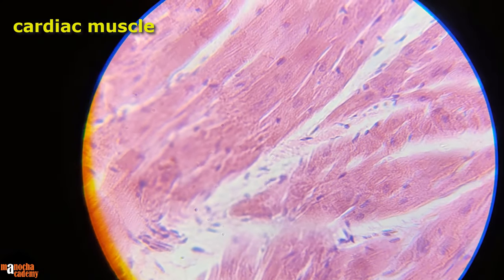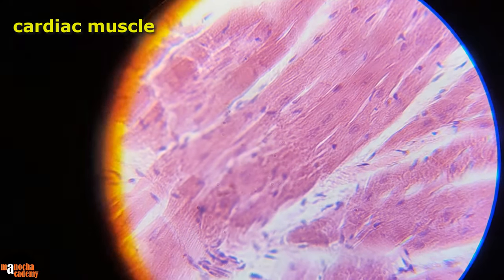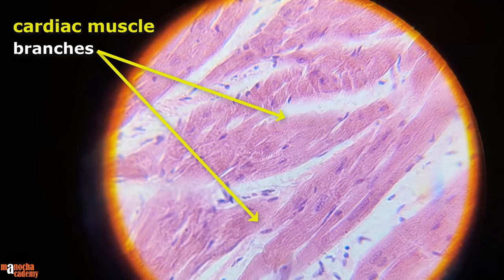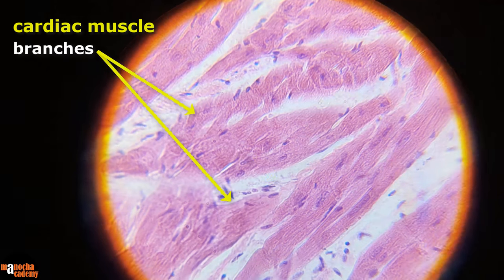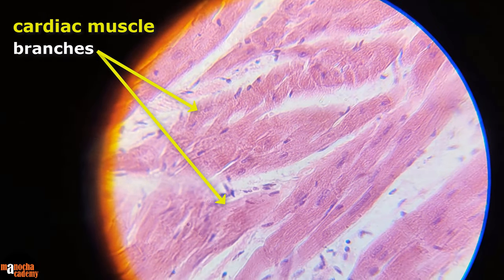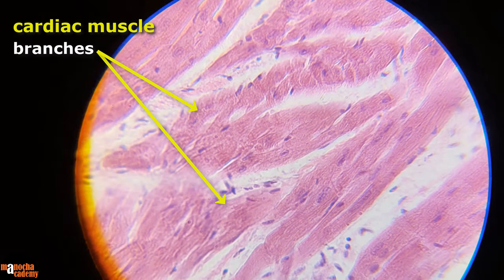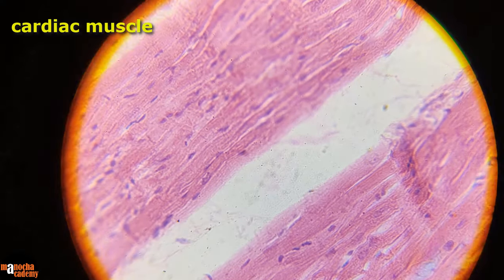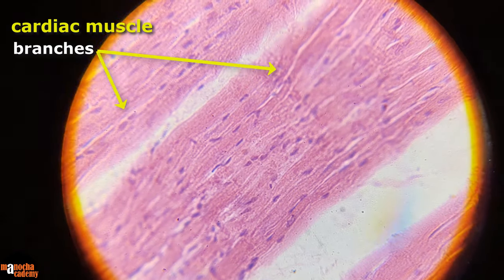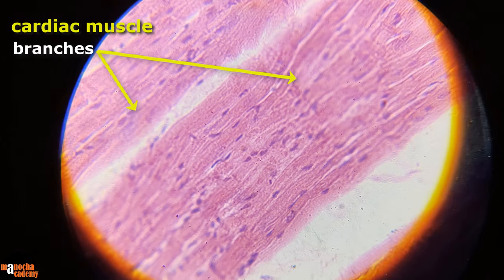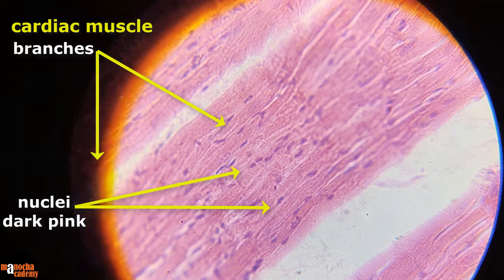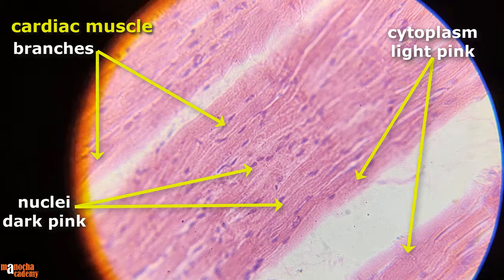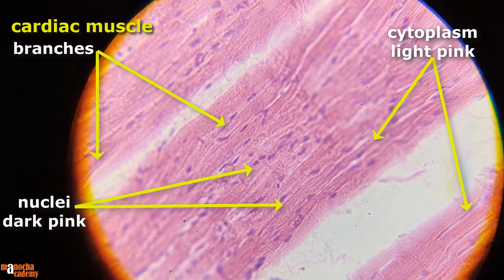This is how it looks under the microscope at 100x magnification. You can clearly see the cells and their branching, but to see the nucleus you need to magnify it a little more. Now at higher magnification you can clearly see not only the cells and their branchings, but also the nuclei which are stained in dark pink or reddish color in contrast to the cytoplasm which is stained light pink.